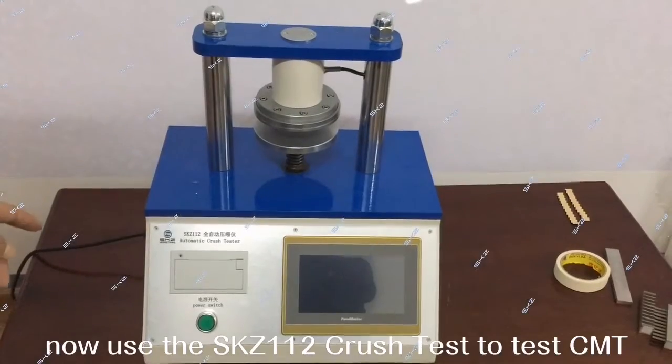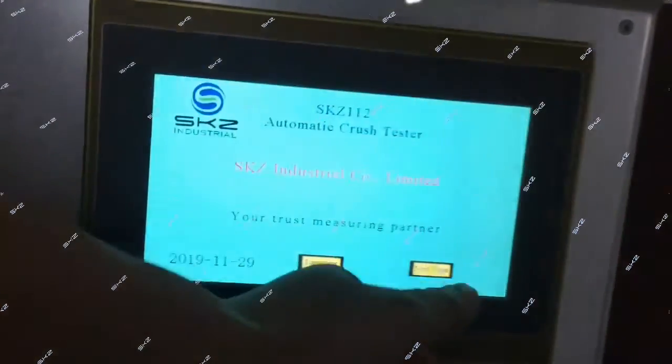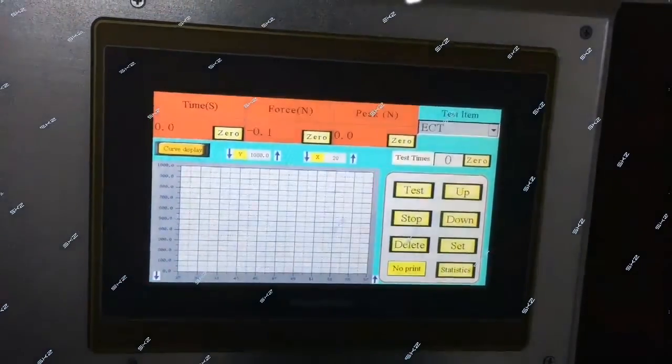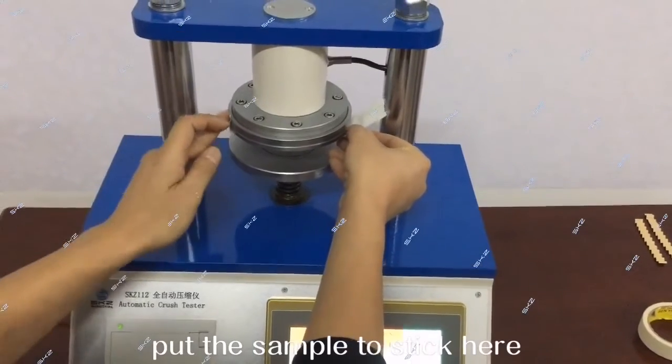Now we use the SKZ112 crush test to test the CMT. Turn on the power. Put the sample in and put the stick here.